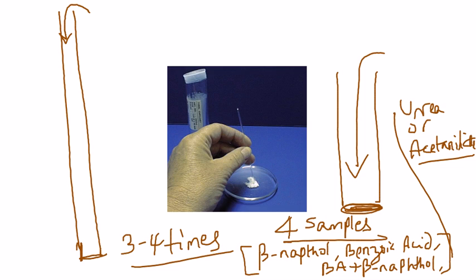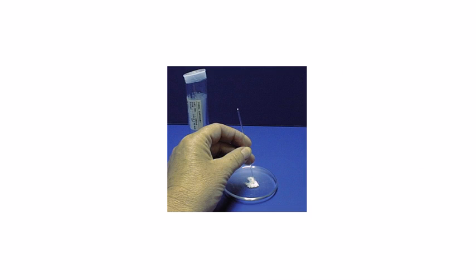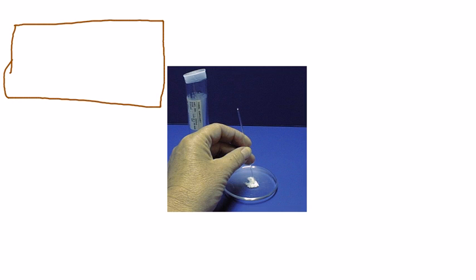The shrinking, sagging, and melting has to take place within 0.5 to 1 degree Celsius, so you have to make sure that your samples are pure and nicely packed. These are some of the precautions you're supposed to take to get good data in this lab.